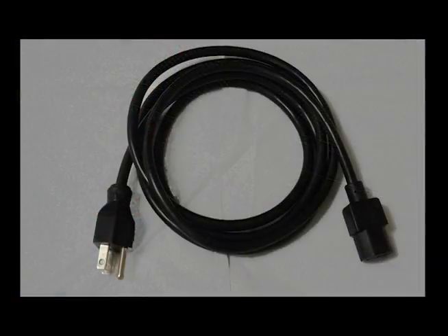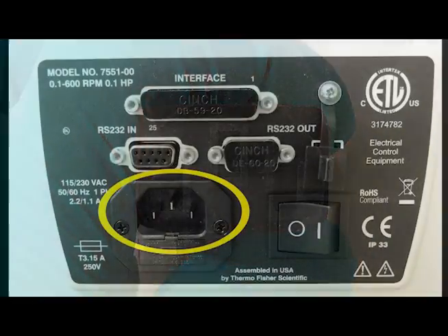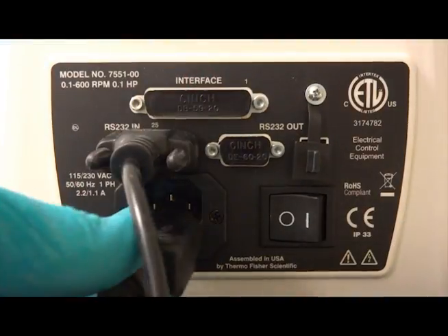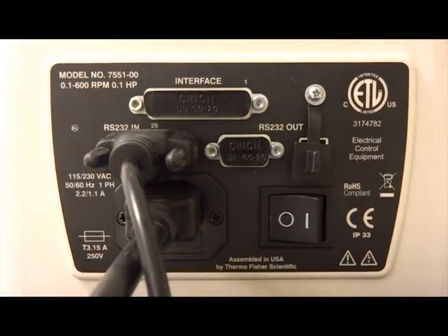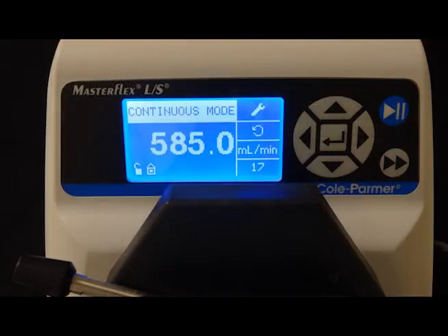Using the provided power cable, connect the female end to the outlet on the back of the MasterFlex pump. The opposite end of the cable connects to the power outlet. Using the flip switch on the back of the MasterFlex pump, turn the pump on. The digital display on the front of the pump will turn on.